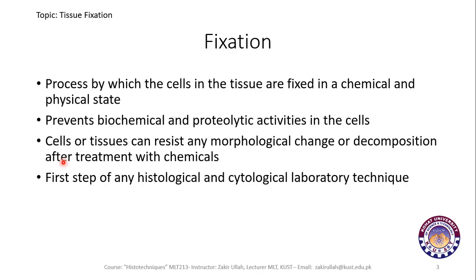So, it is very important that the tissue is fixed properly and that the fixation process is efficient, so that we can continue all our processes effectively, get good results at the end, and study the tissues very clearly. For that purpose fixation is very important, and this is the first step.